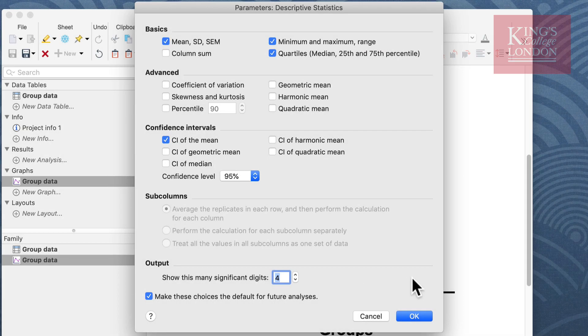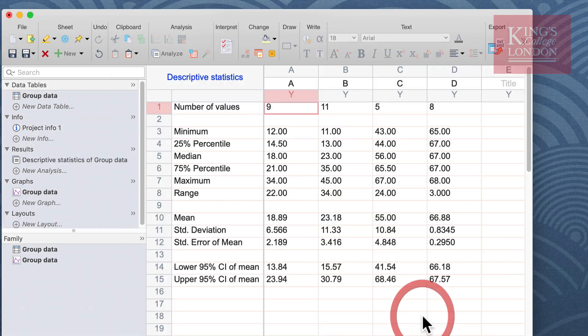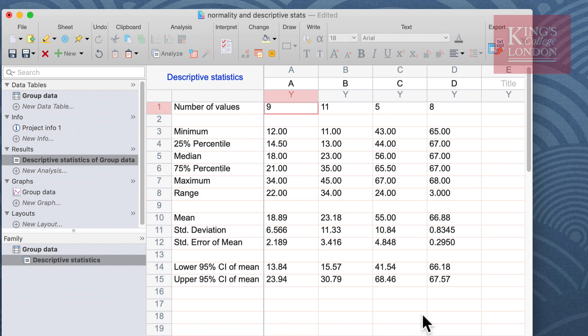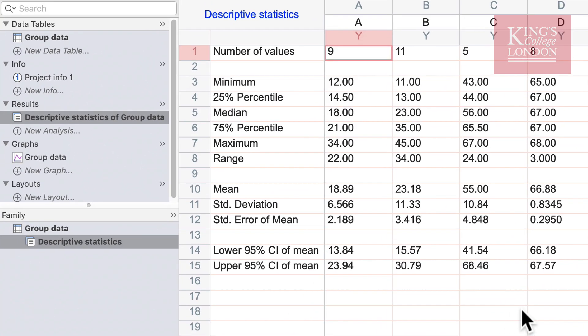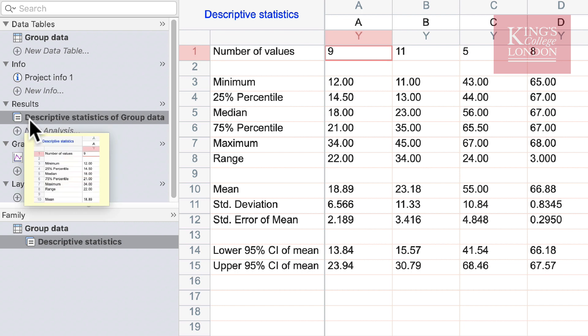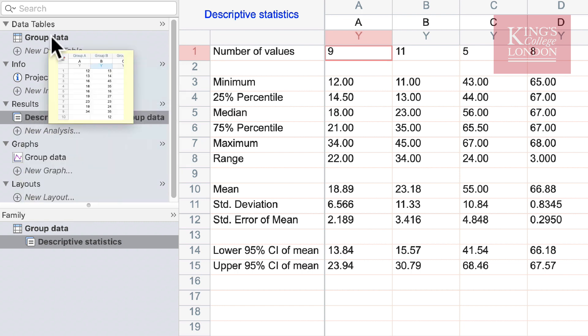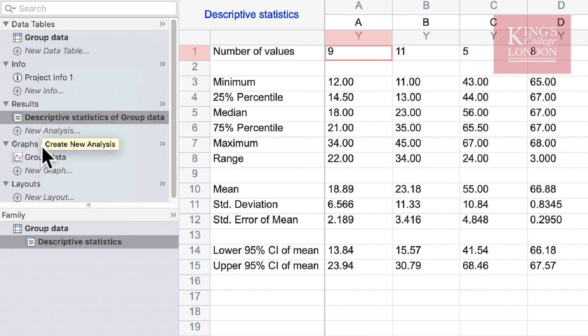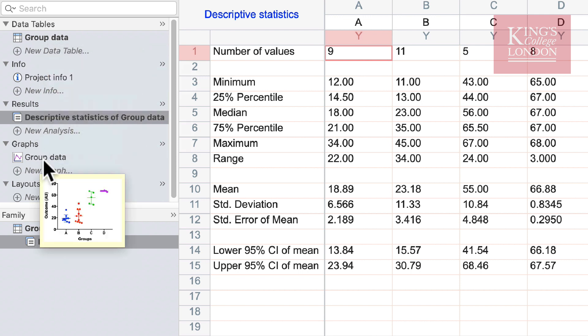Once you've selected the statistics you wish to view you can click on the OK button and when you do this the descriptive statistics results window appears on the screen. On the left hand side you'll see we now have a new results pane called descriptive statistics of group data, group data being the name of the table and the graph that I'm analyzing.